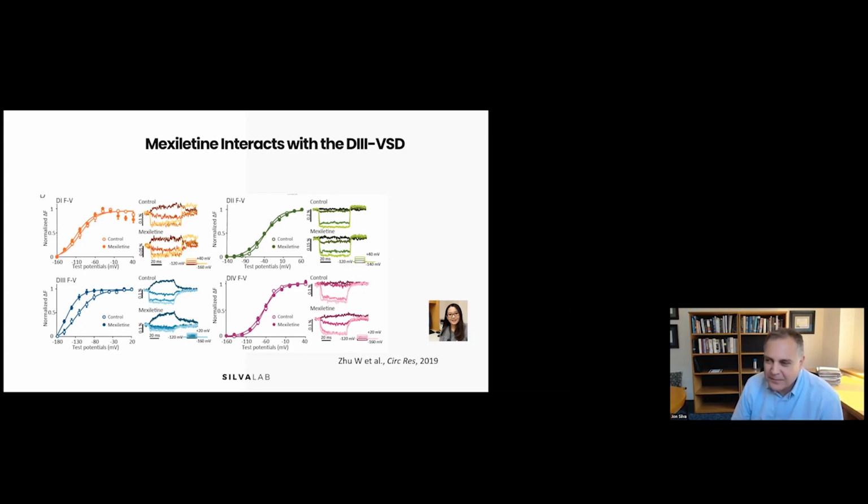Do you plan to use patient-derived iPSCs or something? Yeah. So we have the wild type recordings, and in the next week or two we should have the others, because they need to get to day 30. So we've created the iPSCs. They're growing in the lab now, and we've actually edited them. So we took the patients with the S1103Y variant and the H558R, and then we reverted those back to the more common sequence. So we should be able to compare from a patient's cell with and without that variant, whether there's an effect. Okay, cool.